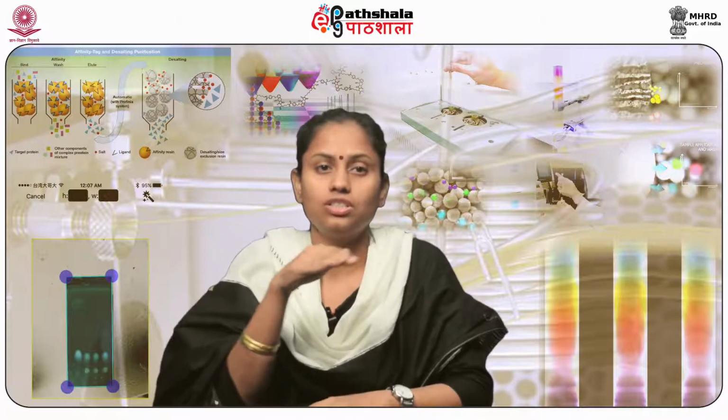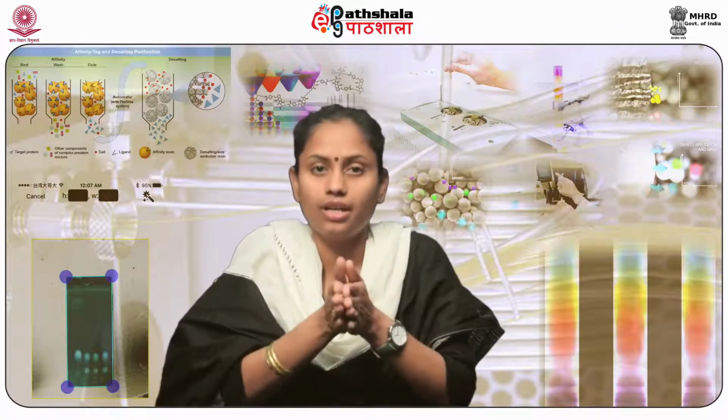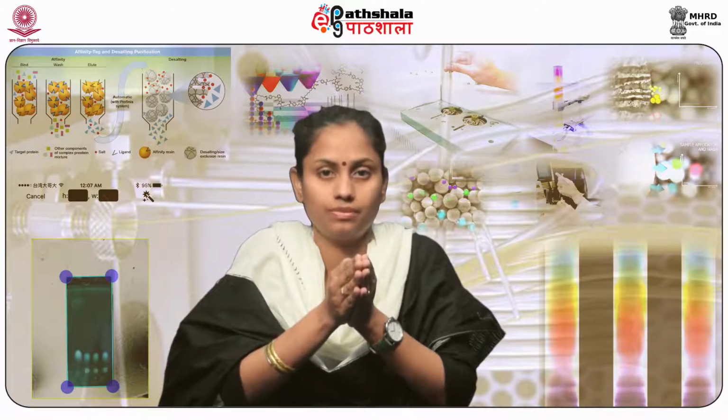In ion exchange chromatography, the stationary phase is a solid resin which can be either cationic or anionic, whereas the mobile phase employed here is a liquid.